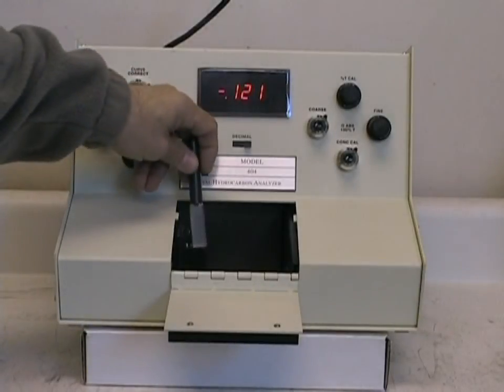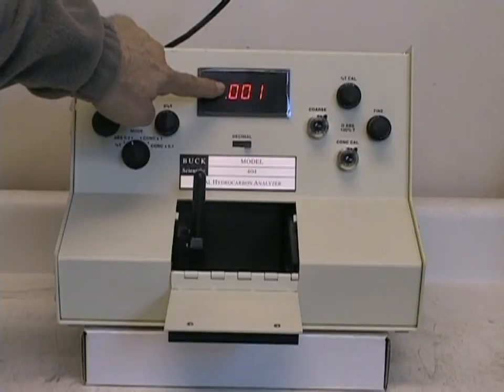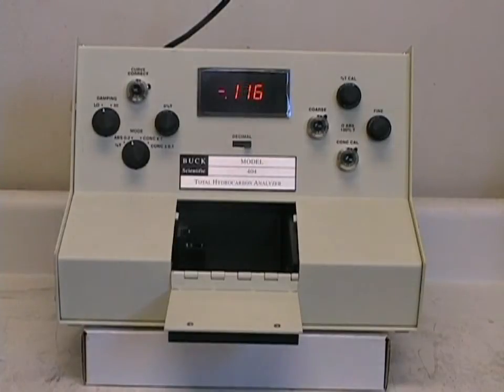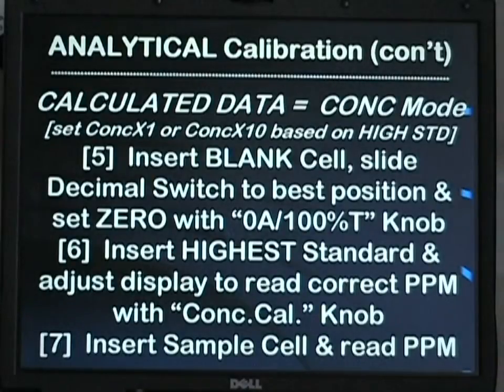It is recommended to check your blank every so often — maybe every 20 sample readings or once an hour — to make sure you have a zero absorbance signal for your blank. The internal A to D converter can be used to calculate the concentration of a sample compared to several standards and read out in parts per million directly. These procedures are detailed in the complete HC-404 manual and the one-page mini guide included with each system.